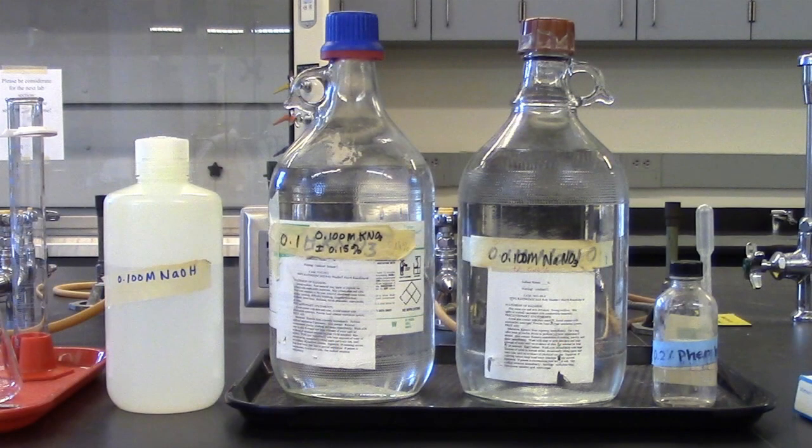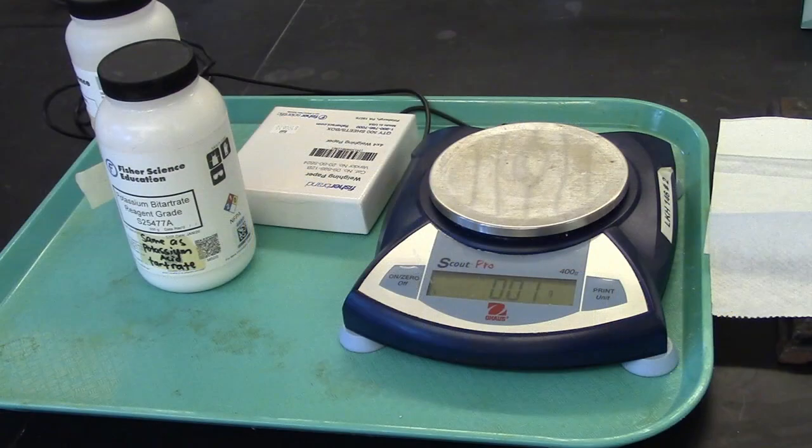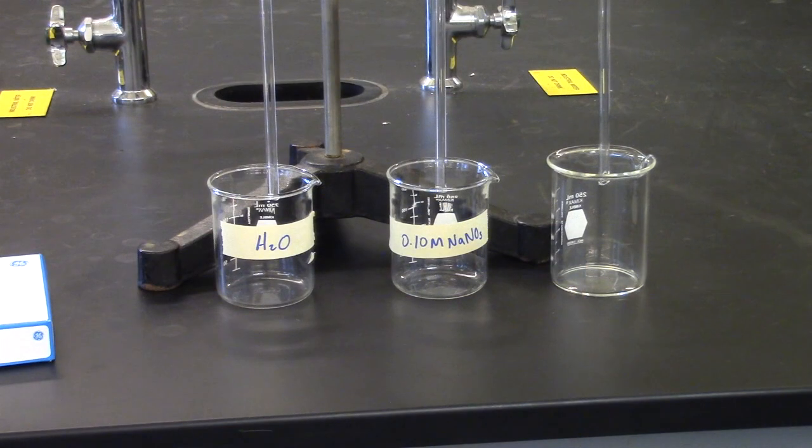You will use the following solutions: 0.1 molar NaOH, 0.1 molar potassium nitrate, 0.1 molar sodium nitrate, and 0.2 percent phenolphthalein. You will use a single pan balance and weighing paper to weigh out your sample.